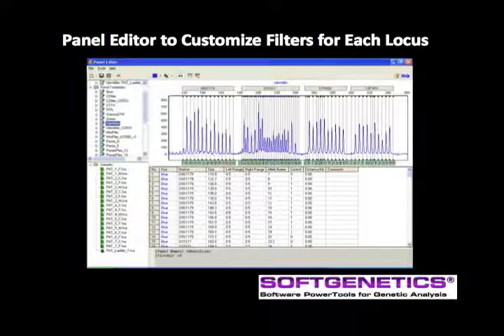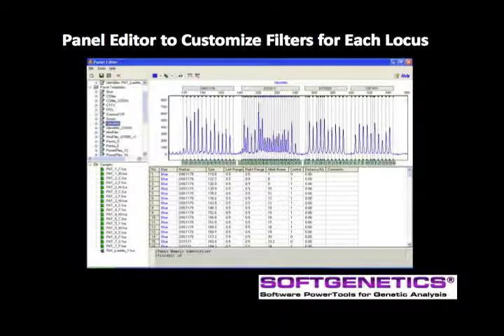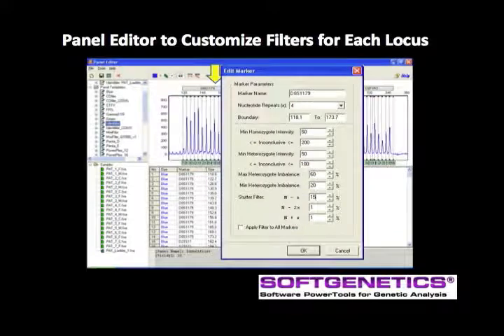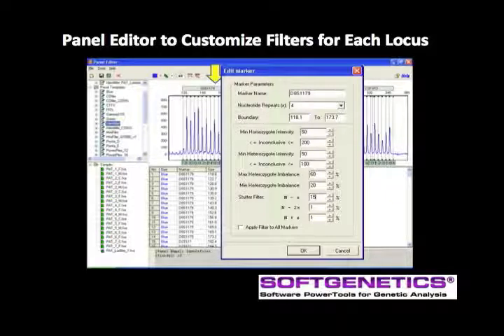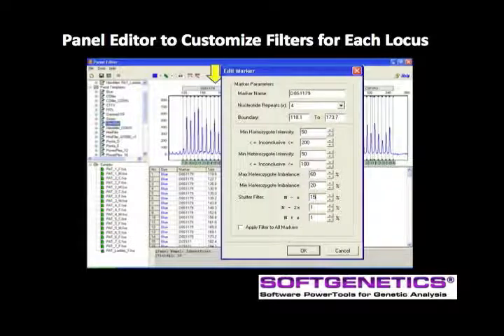Heterozygous imbalance and stutter rates may vary from marker to marker. GeneMarkerHID allows the user to easily customize the parameters for each locus by activating Edit Marker with a right-click on the marker label above the electropherogram. The minimum homozygous and heterozygous intensity is the minimum RFU, or peak height, that will be called within this marker. Depending on your lab SOP, set this value at the analytical range for the CE instrument, which would be the same value for both homozygous and heterozygous calls, or set different levels for minimum peak height for homozygous and heterozygous peaks.